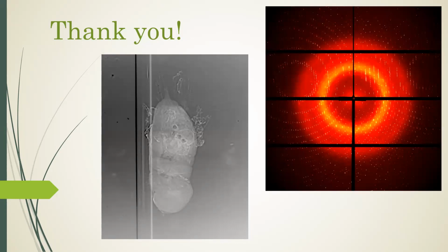Yes, a question. As a software engineer, is your source code available? So in the case of Tioga, we actually gave it to Soleil, to the two beamline scientists who are there, Martin Savko and I forgot the other person's name, but they have it, and from what I know, they have been using it in parallel with the file writer. But it's not available on a repository with an open source license? No, but if somebody wants to use it, they could just ask and we will give it to them.